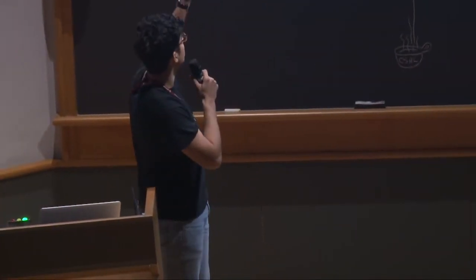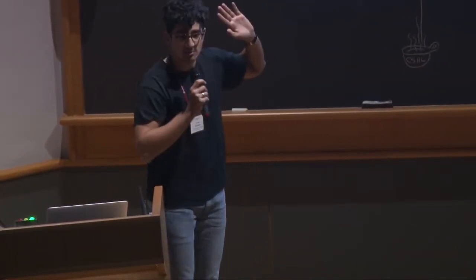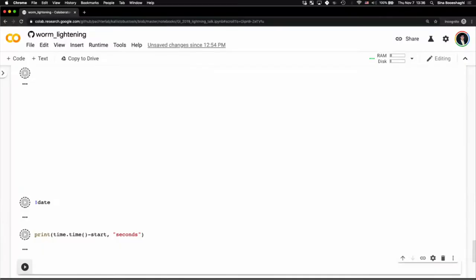And what you're seeing right now is actually a complete single cell analysis of C. elegans from a data set of 86,000 cells out of Bob Waterston and John Murray's lab from UW and UPenn.